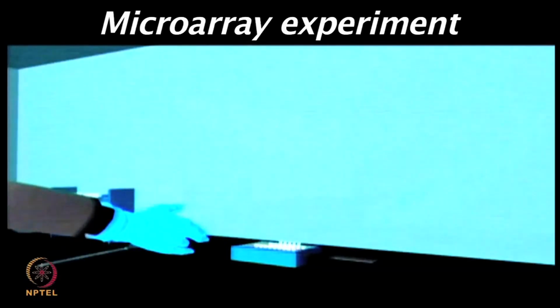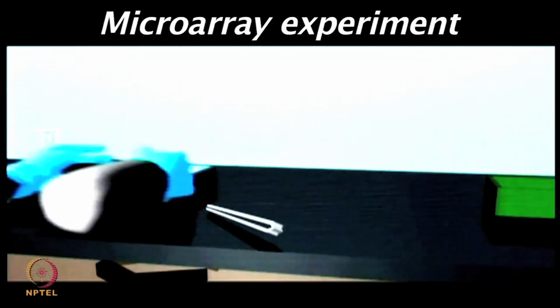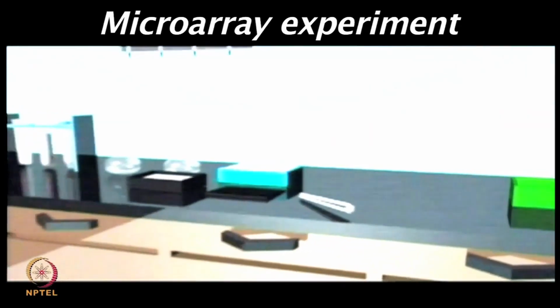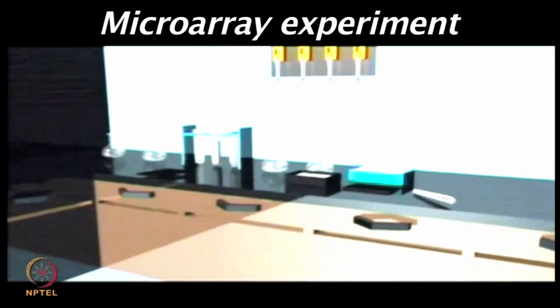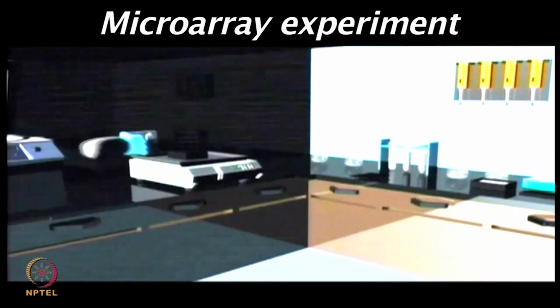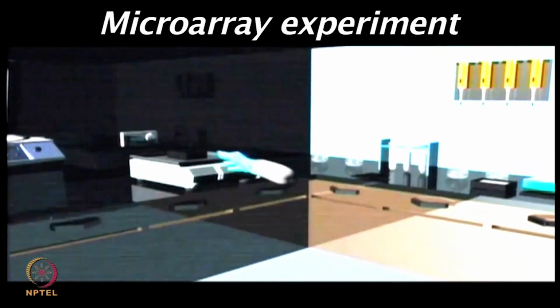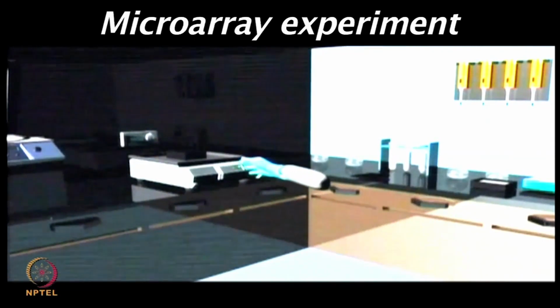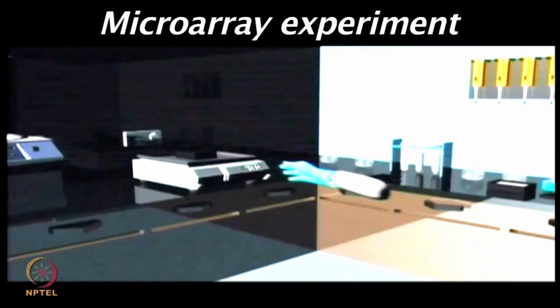identifying the right targets. On the other hand, if you are allowing it very long, for example, overnight incubation, it is possible that background will become very high. So, people try different types of conditions in the labs, and then they apply serum or primary antibody and adjust the times for the incubation accordingly.